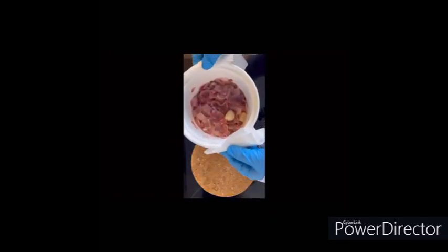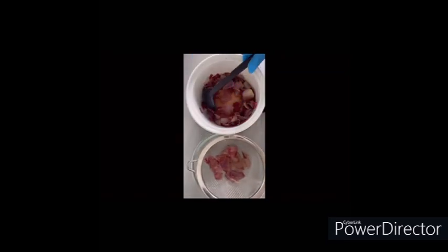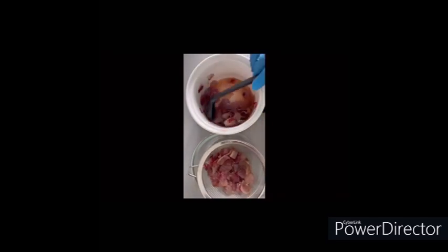And then, remove the mixture from the heat and allow it to cool down while soaking the onion for 30 minutes to avoid overheating and the loss of anthocyanin pigments. Finally, using a sieve or preferably a filter paper, filter the onion pieces from the onion extract by pouring it into the filter or sieve.